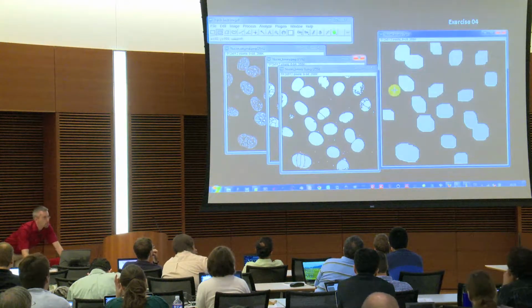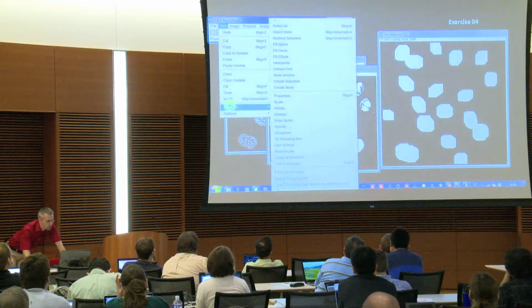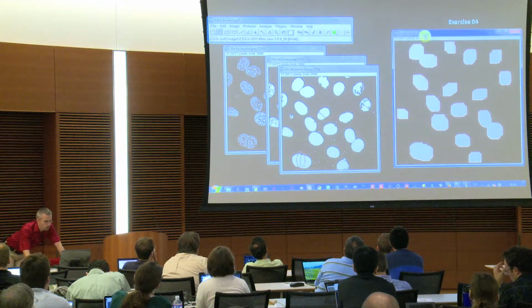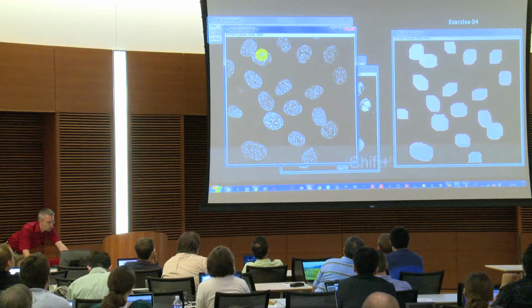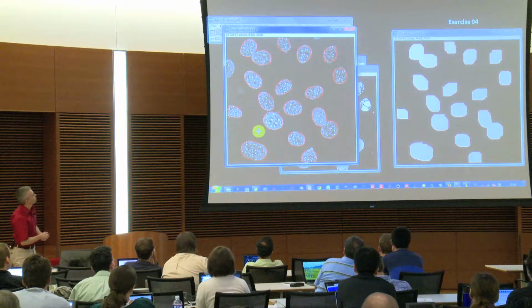So if I create a selection from that here by going to edit, selection, create selection, just to show you that on the original, I get selections around those objects, and if I go then to the original and project them with Shift E, then you see this is not so nice.